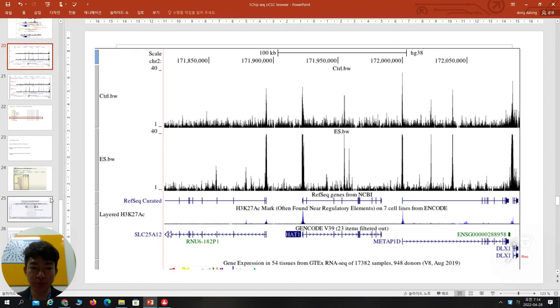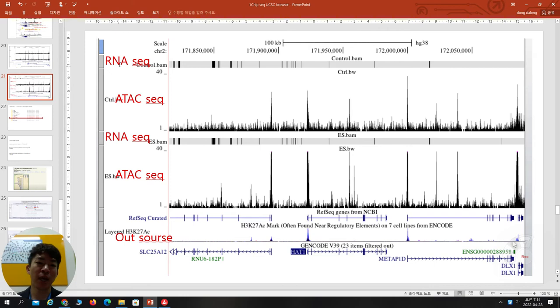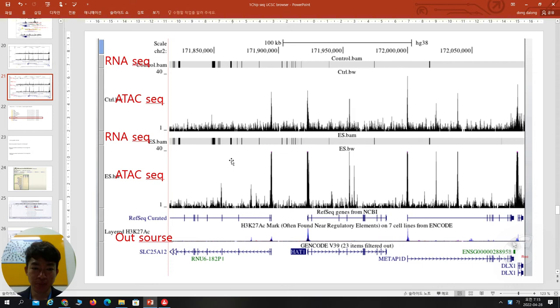You can make a plot showing RNA-seq, ATAC-seq, and ChIP-seq data together, one by one. This is RNA sequencing — you can display it as peak or dense format, and show both together. When you search other literature, sometimes they show it this way. You have to think about how you want to display your sequencing data and which kind of public resource you can use. For mRNA sequencing, you can upload BAM files to Cybers.